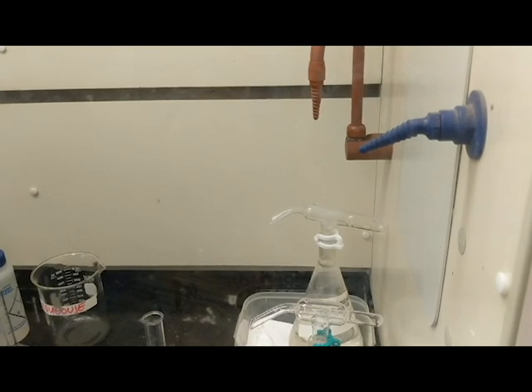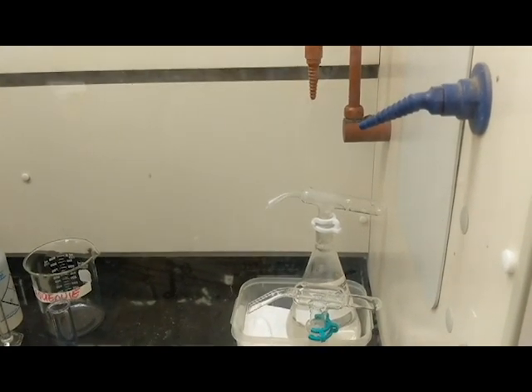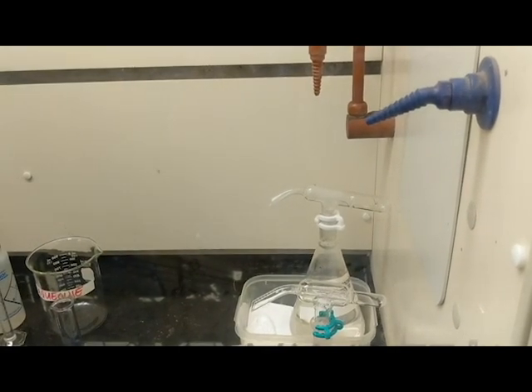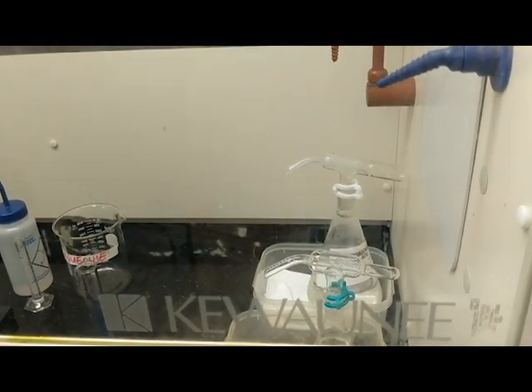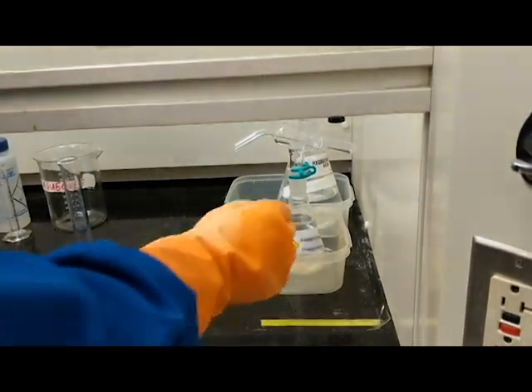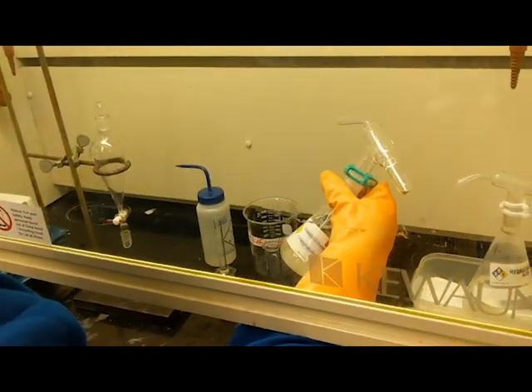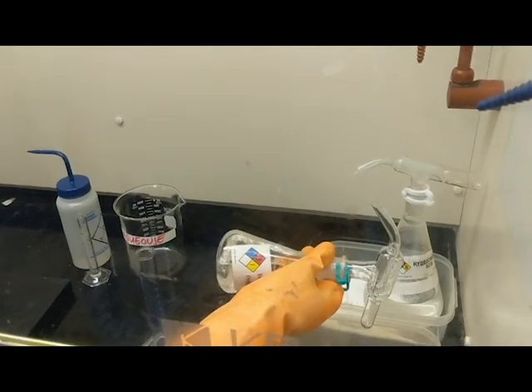Your faculty may instruct you to do this differently, and you are to follow their guideline on how they want you to hold and dispense the solutions from the repipetter. Always keep the repipetter in secondary containment. If there's any dripping or spillage, it should fall into the secondary container. We're going to use 10 mLs of our starting product, that's 2-methyl-2-butanol, to fill this repipetter.